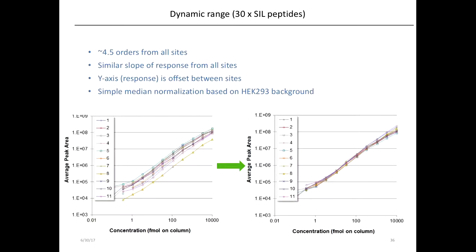So these are the performance of the different sites. We can claim that if these data are acquired with a fairly standard acquisition technique, and then if there is a simple batch effect or sensitivity correction of the instruments, each one of the sites generated for these peptides fairly nice dilution curves with similar dynamic range and similar limit of detection, although the limit of detection is not identical. You see some go further down because the instrument was more sensitive.